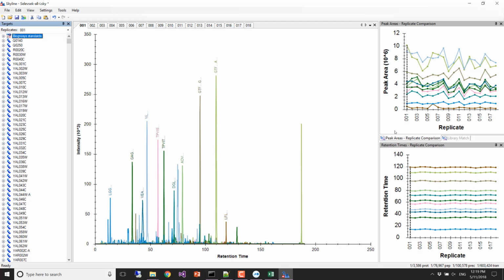And so the question is, do we need to do discovery proteomics on everything in order to have the best chance of discovering things? Or, what we're beginning to contest is that it's possible that you're actually adding false discoveries and reducing your sensitivity, which will actually even cause you to have more false negatives. So it's kind of counterintuitive, like, oh, if I add more things, then I'll be able to detect everything that is happening. But it's actually possible that you miss more things by adding more things, right?